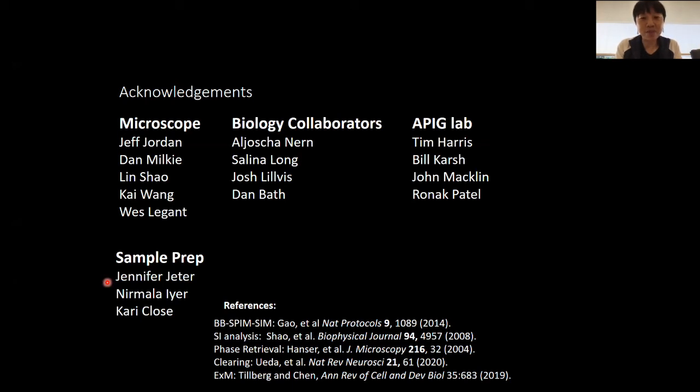I want to start with two of my questions. You talked about structured illumination. Can structured illumination be combined with other microscopes other than the Bessel beam selective plane illumination? It can be combined with any kind of selective plane illumination. It takes a lot of work to build it into a wide field microscope, but of course that's where it was developed.